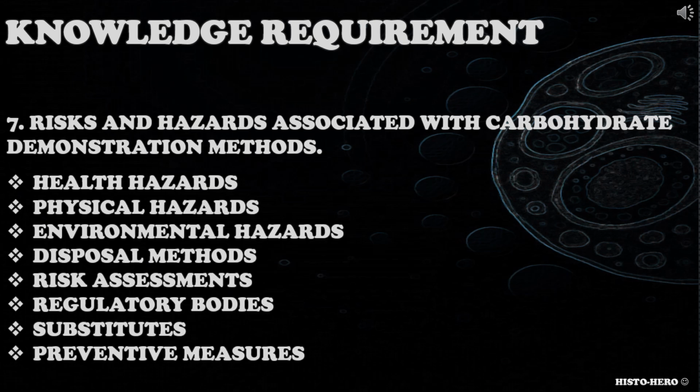physical hazards, environmental hazard, disposal methods used, risk assessments, regulatory bodies like COSHH, HSE, or RIDDOR, substitutes available to reduce risks and hazards, preventive measures like PPE, ventilation, waste segregation, and safe handling.